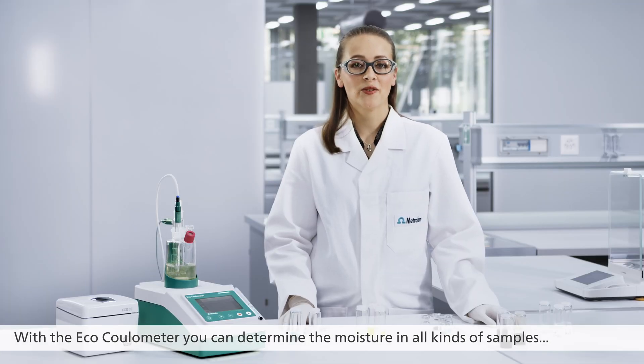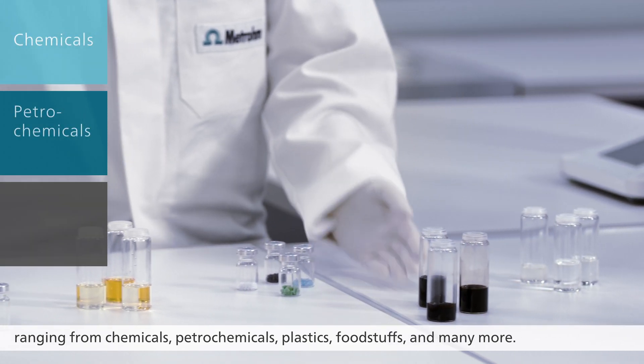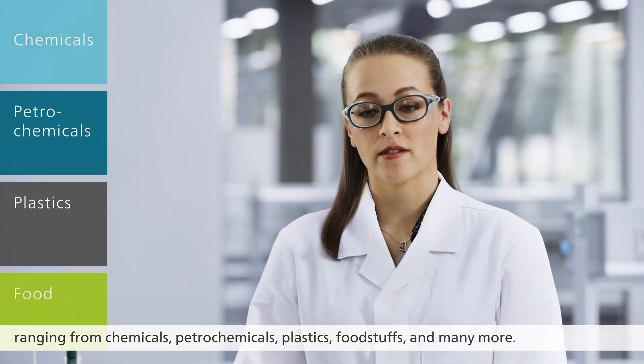With the Eco Coulometer you can determine the moisture in all kinds of samples ranging from chemicals, petrochemicals, plastics, foodstuffs and many more.